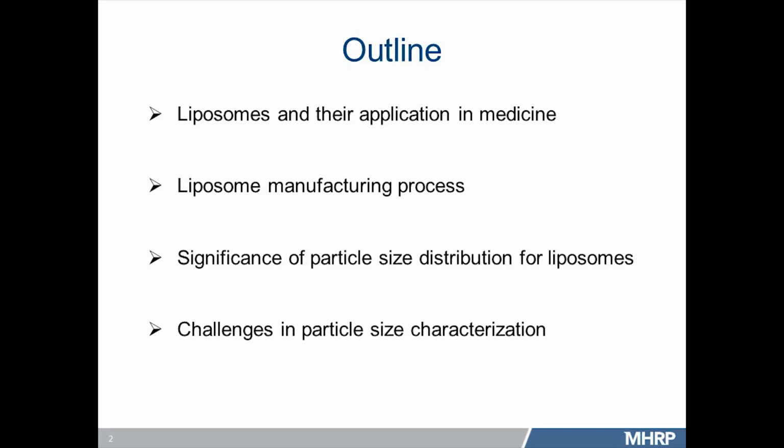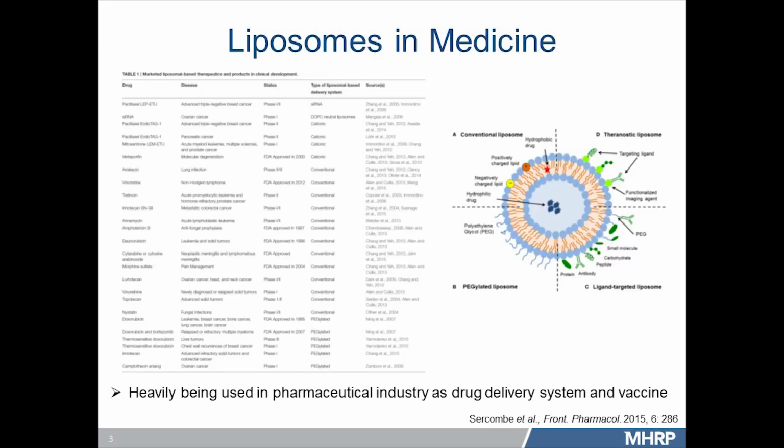All right, so to the first part, here I show you this table in which marketed liposome-based therapeutic products have been detailed. You may not see all the products here, and there is a lot of text on it. What I want to convey here is that many such products are already in the market, FDA approved, and many more are coming. They are undergoing phase 2 and phase 3 clinical trials.